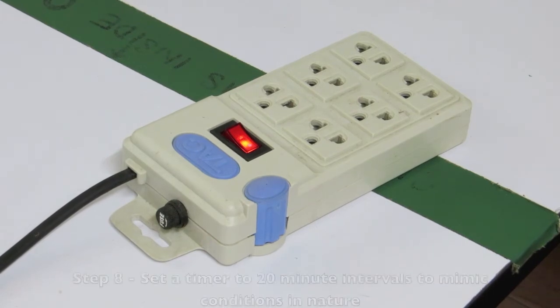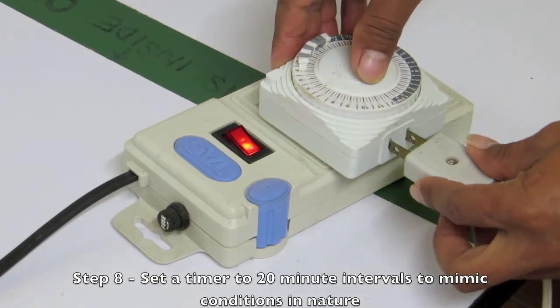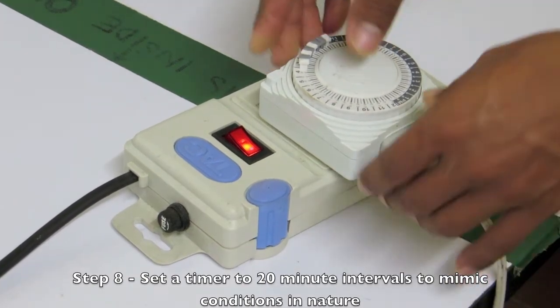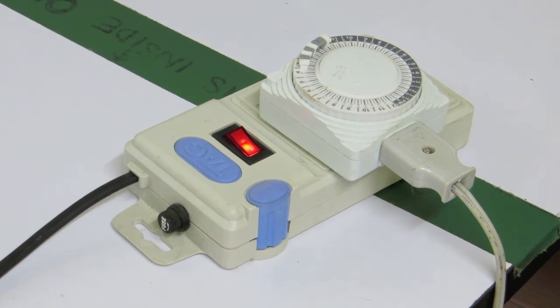Number eight — make sure the timer for the germination cabinet is set to 20-minute intervals to mimic conditions in nature and plugged into an electrical source.